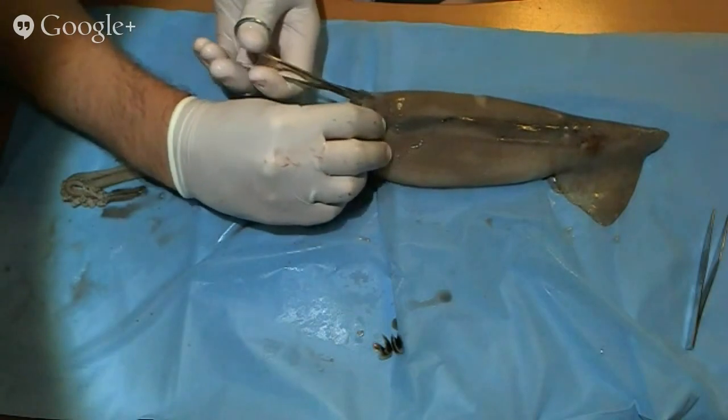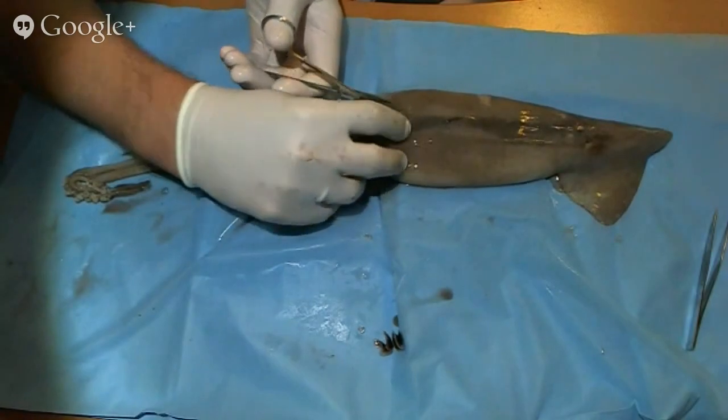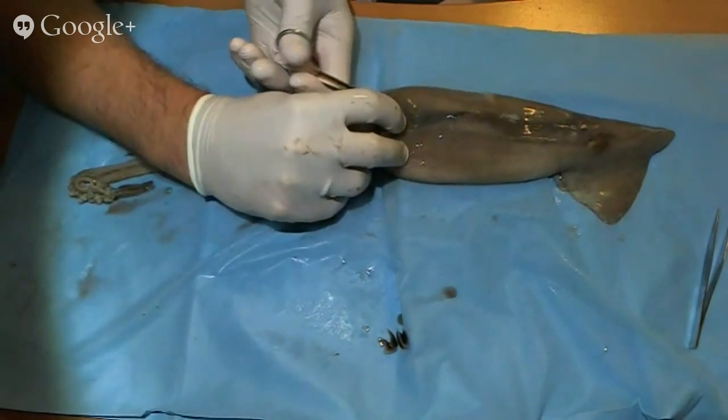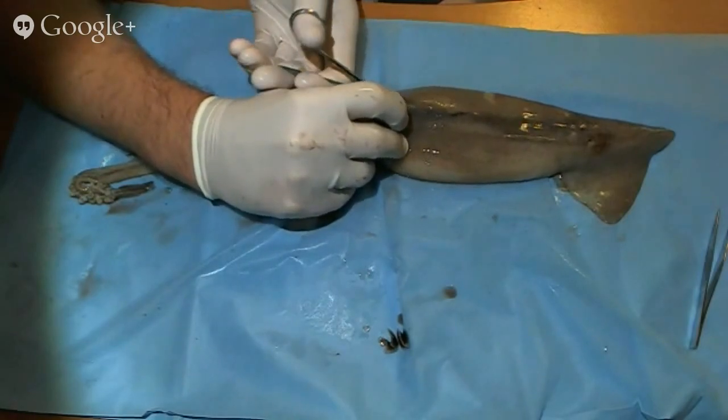So if I just cut straight up the mantle of the squid, I always tell kids to point with their scissors up as best they can. This happens to be really thick, so sometimes you have to help students do this.